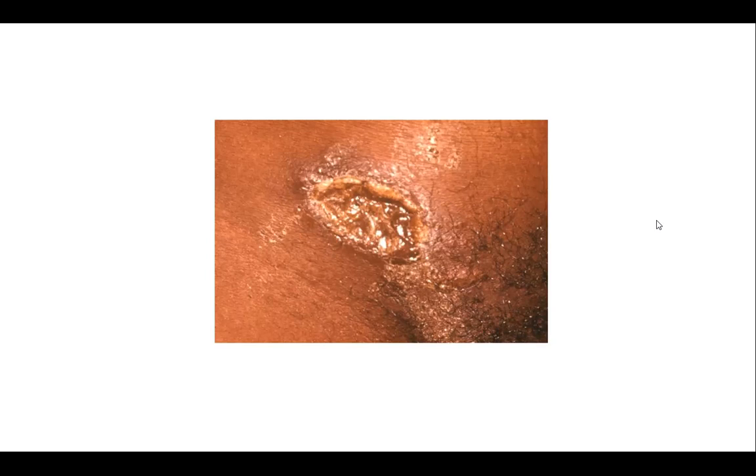So let's look here. What does this tell you? Syphilis. There's a pattern. The cells, they're not spirochetes, but they have a certain arrangement, the school of fish pattern, like rods following each other in a single line. So which disorder gives us the school of fish appearance? Chancroid. What organism causes chancroid? Haemophilus ducreyi. Very good. Ducreyi.